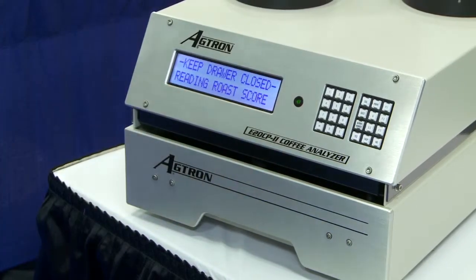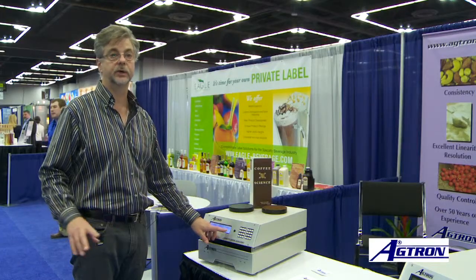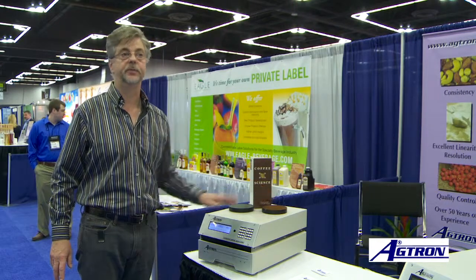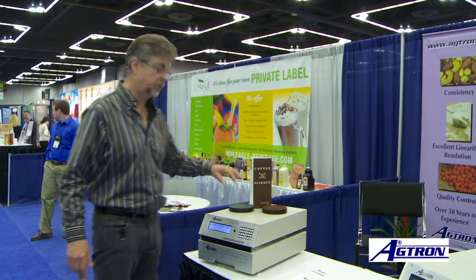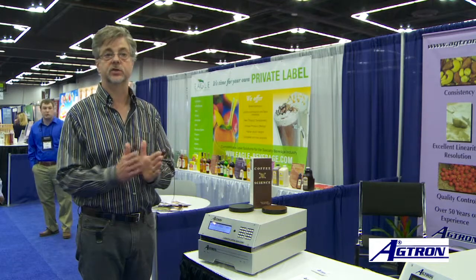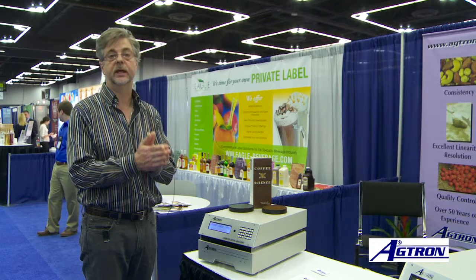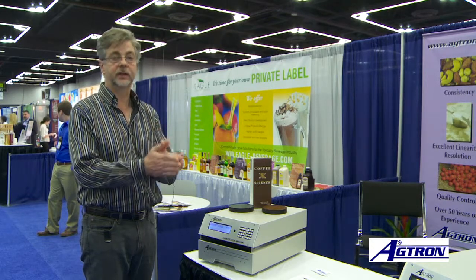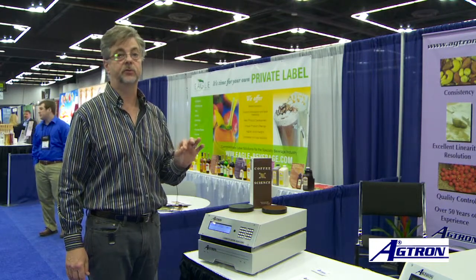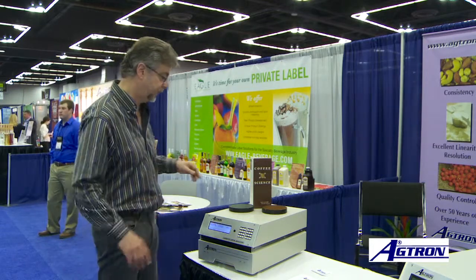The analyzer's taking the measurements right now using 3 specific wavelengths of near infrared, and it comes up with a score. The way the scale works, 0 would be if you thermally degraded all of the organic chemistry in the coffee, it would be carbon. It would have no smell or taste. And 100 on the Agtron scale would be a point where 3 to 5% of the sucrose by weight had fractured. That's where the first crack occurs. If we were able to stop the roasting process instantly at that point, we would grind it, extract the chemistry, and it wouldn't be a commercially viable coffee. It would be very, very undeveloped as a roast, but everybody would know it had the quintessential characteristics of coffee. So you'd be able to identify it as coffee.